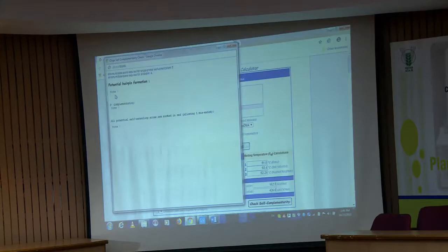So, always handle such nucleotides or PCR amplicons, or whatever you are handling, carefully, because these are very sensitive at room temperature or at higher temperature. So, always try to keep them stored at -20. Whenever required, you just thaw it, make the required volume of your 10 picomole or 5 picomole, and then use it in your PCR. Okay. So, can we proceed further?